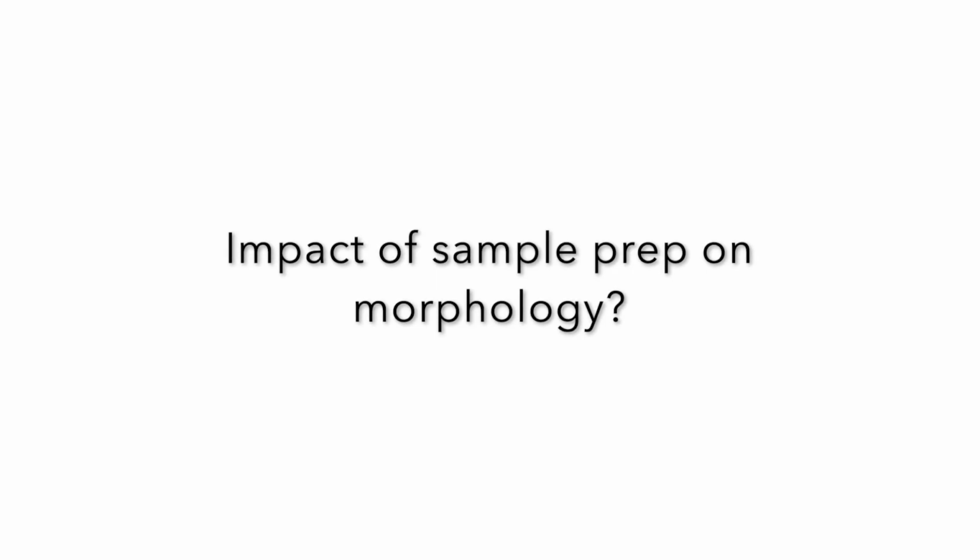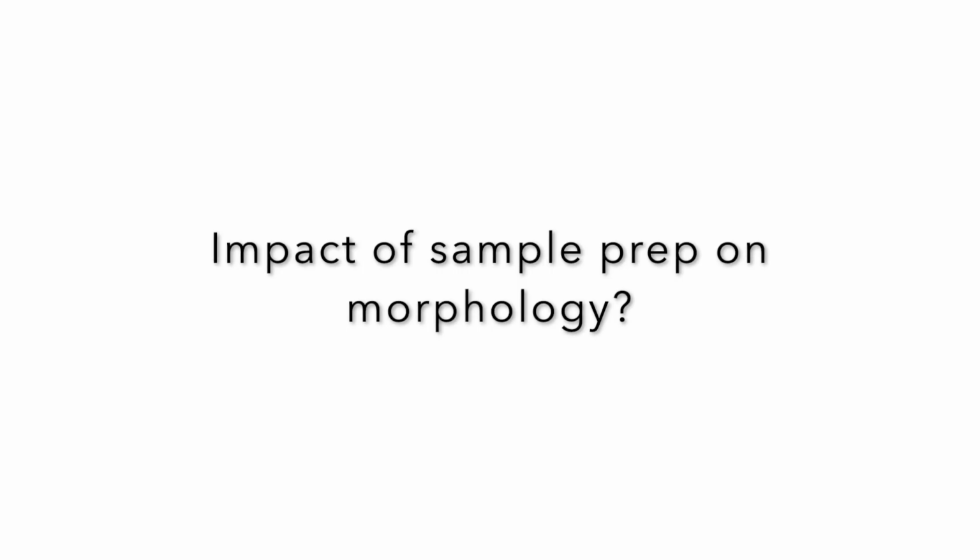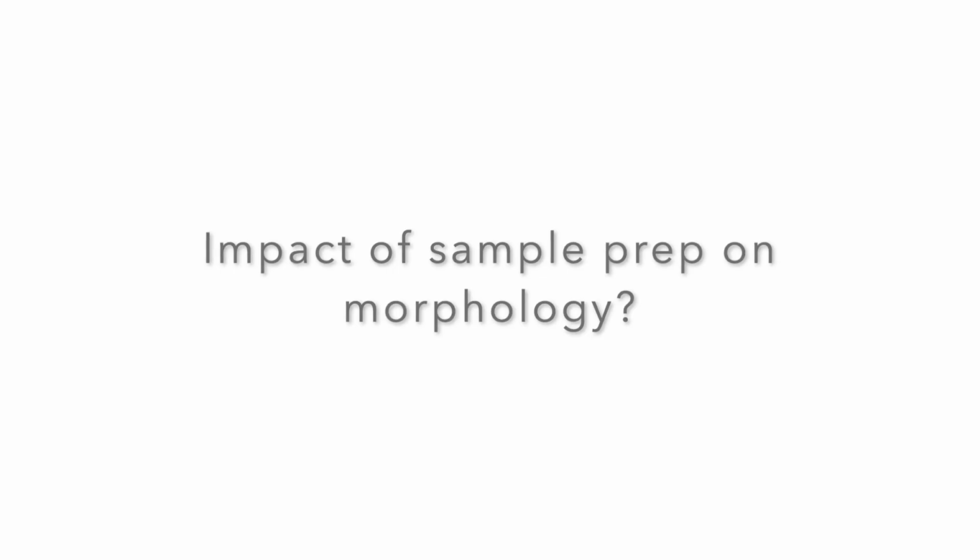Sample prep is very important when you're looking at understanding morphology and also standardizing morphology as a readout in these use cases. The most important thing when you are preparing your samples is to remain consistent and optimize your processes to be gentle to the cells in order to allow them to stay in their most unperturbed state. So we have a lot of researchers that perform various methods of sample preparation, whether that's tissue dissociation, fixation, thawing from cryopreservation, pulling straight from cultured cells. It's just very important to remain consistent.